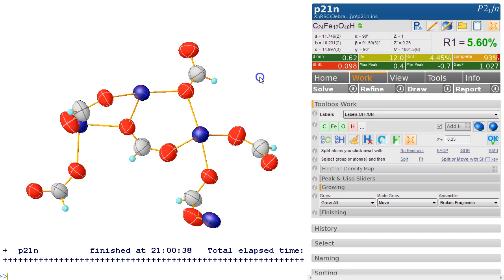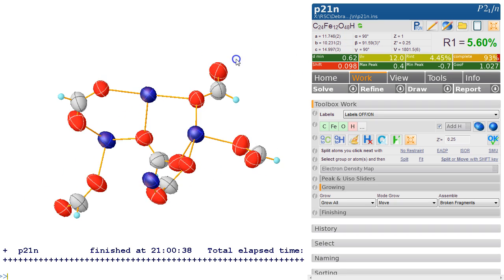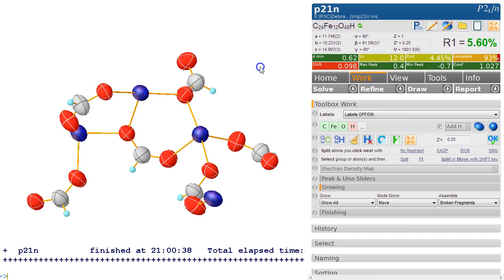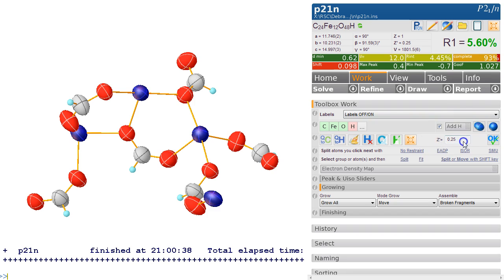Now to me, that looks like a structure that's probably known. We need to find out the formula unit of this. At the moment we've got Fe12—well that's not really very sensible, but that's because that Z prime is at 2.25.